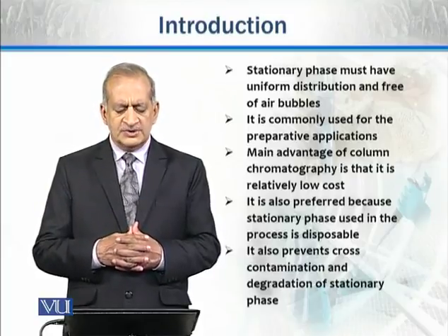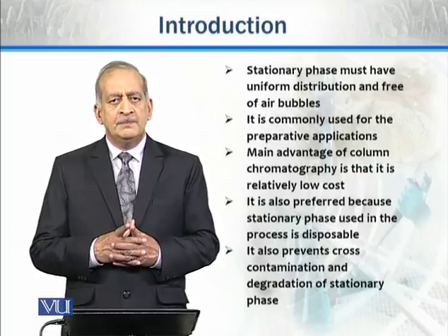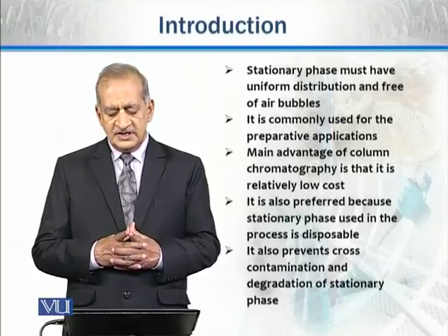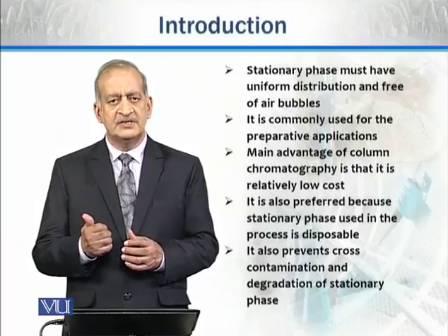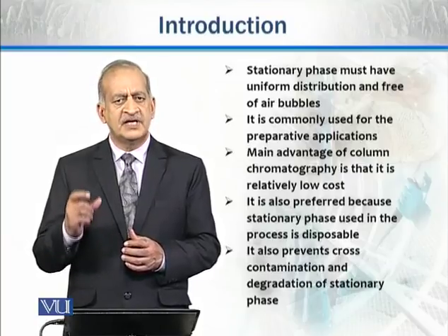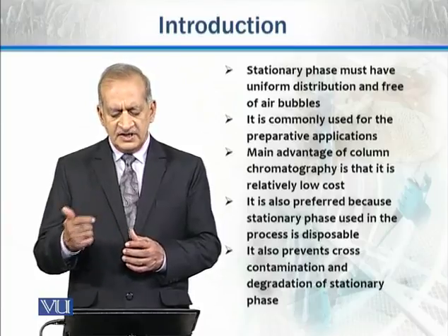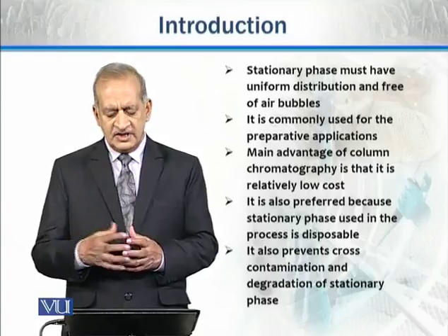It is commonly used for preparatory applications. The main advantage of column chromatography is that it is relatively low cost as compared with other methods, which are expensive. Obviously, other methods involve equipment, so they are expensive. In comparison, here we will say this is economical.